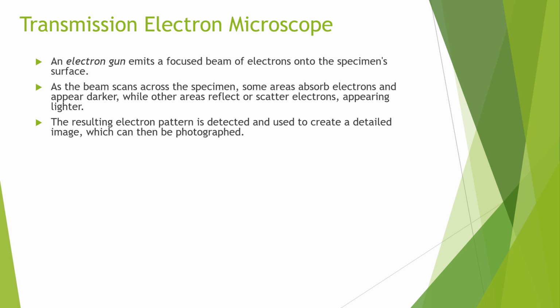TEM images have a unique level of detail that allows scientists to observe structures with remarkable clarity. However, there are a few limitations to keep in mind.